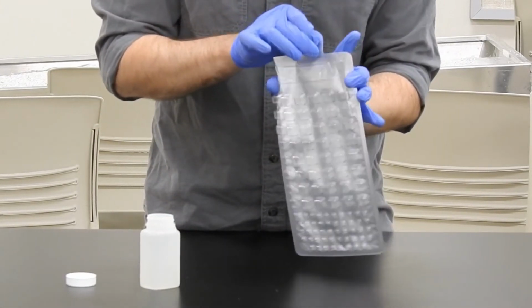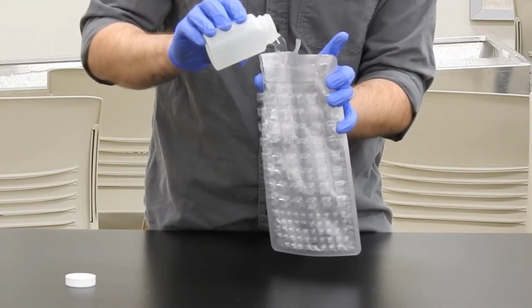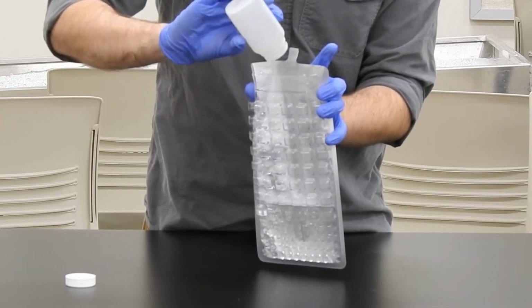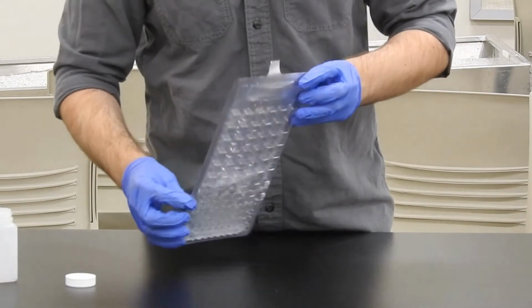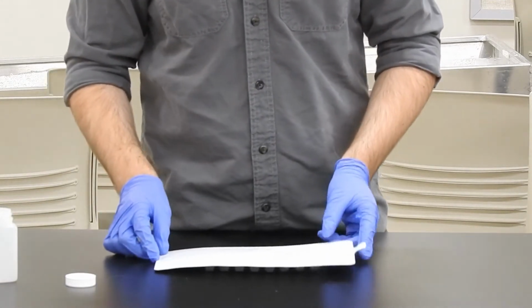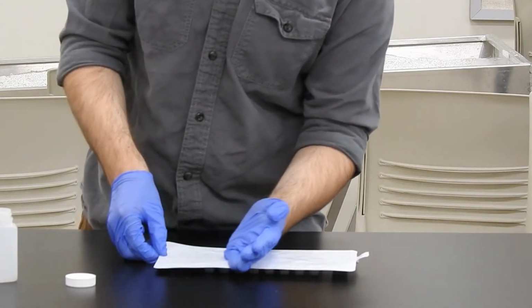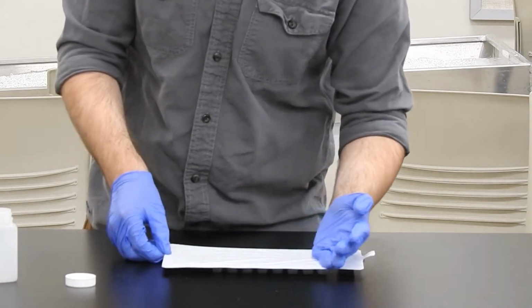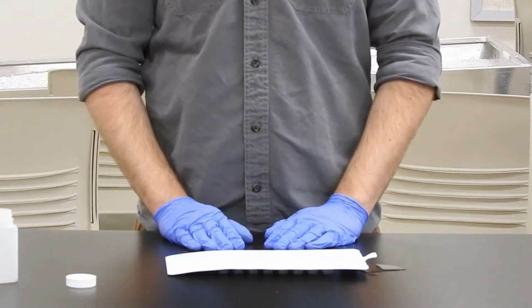So there's kind of a trick to this. You have to kind of hold it with one hand to keep it open, just making sure you don't reach your hand into it to keep it sterile. And then you'll add all the water, which you'll notice goes down to the bottom. But once you lay it on its side, as the cells fill up, the water will overflow into the following cells, and then you can use the back of your hand or a flat object to kind of evenly distribute that water. In this example, I used more water than we normally do in the process, so you can see me spill a little bit there.